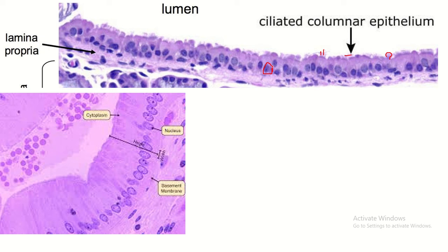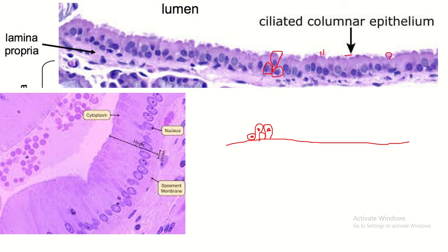It is pseudostratified because it is actually a simple, single-layer epithelium, but the size of the cells is different — some are shorter cells and some are taller cells. So the nuclei are situated at different levels, which makes it look like a stratified epithelium, but it is actually a single-layer epithelium.